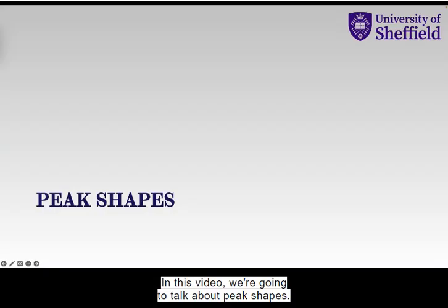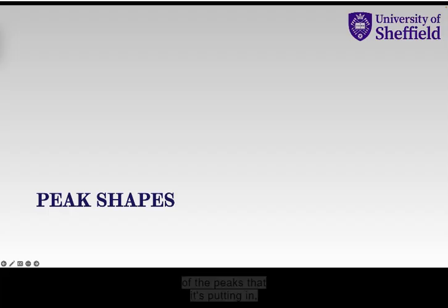In this video, we're going to talk about peak shapes. Now, we've said that we can think of our diffraction pattern as a background with some sort of peak sitting on it. And when mathematically the program is doing its calculation of that diffraction pattern, it's obviously going to need some sort of function to define the particular shape of the peaks that it's putting in the diffraction pattern, and use those to fit the data.